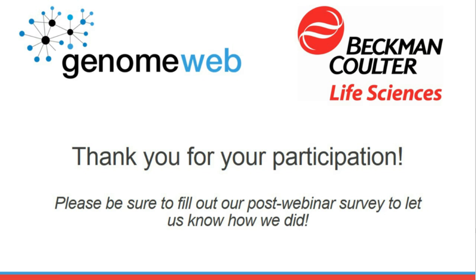That's a good question. The volumes stay in the destination plate by surface tension. Obviously, that depends on the liquid type and the coating, but let's say I have water in a 96 well PCR plate. I have been able to go to 20 microliter upside down, no problem, because the surface tension holds the volume. And that's how ECHO has been used historically. Always the destination plate has been upside down, and it has been no problem.